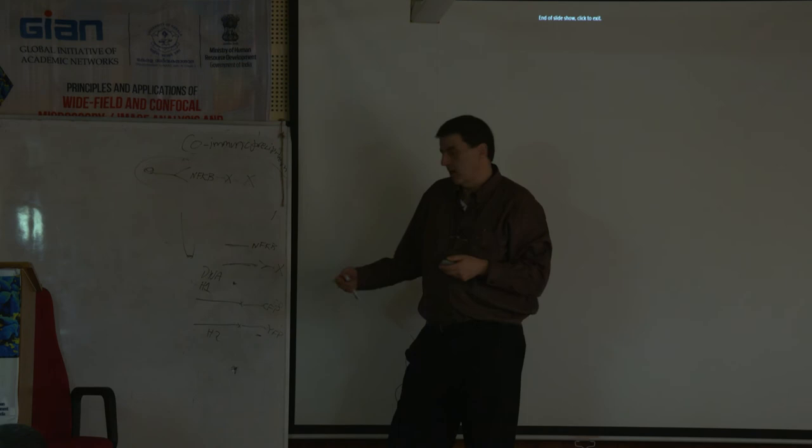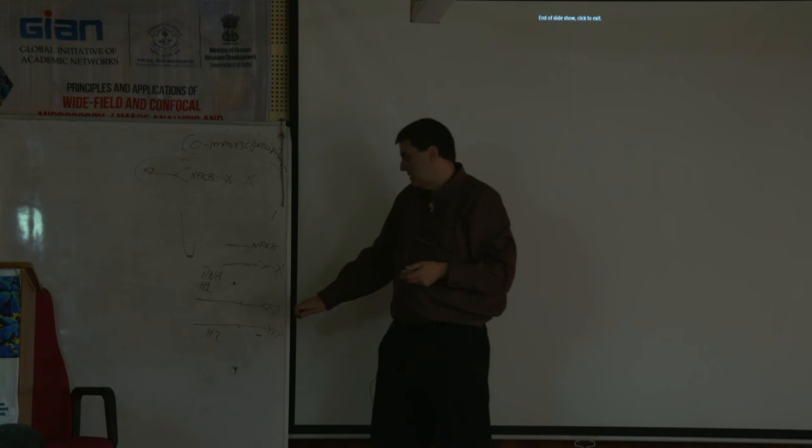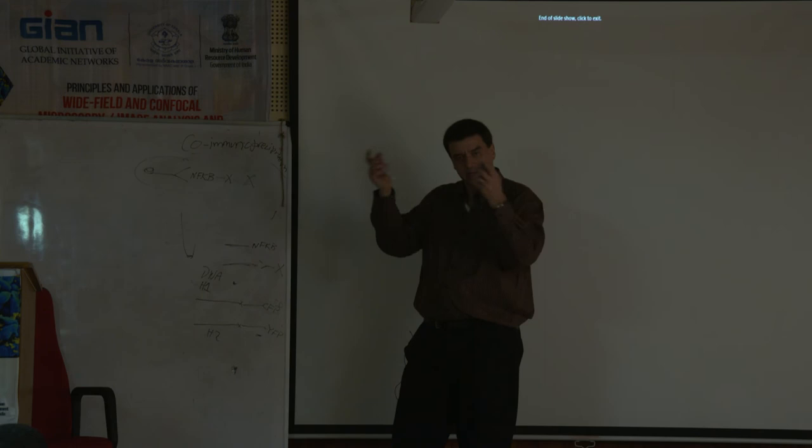Okay, but it's actually a lot of pictures, and I haven't done it in quite a while. In MetaMorph, you're taking a series of pictures of the CFP, a series of just the donor, and it puts it all together and gives you the answer if it worked or not. So it's a lot of different pictures.